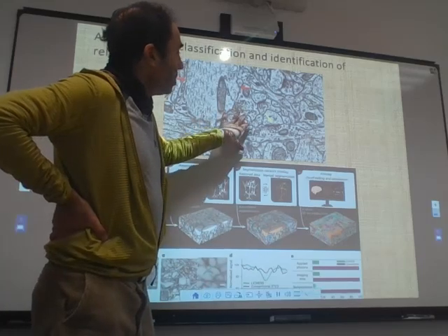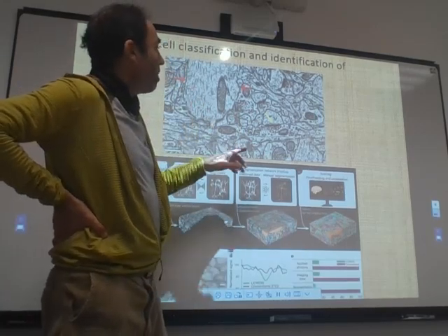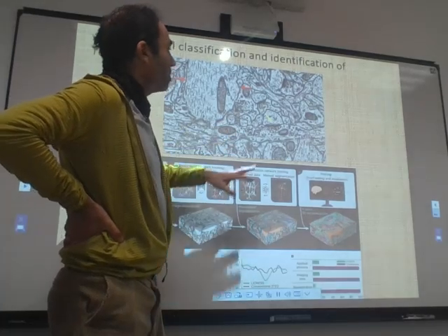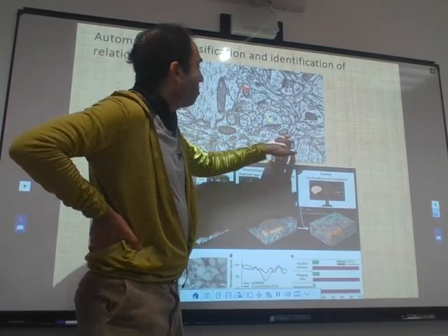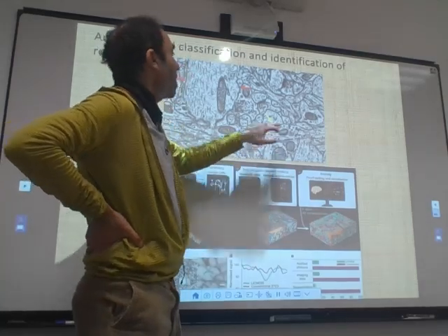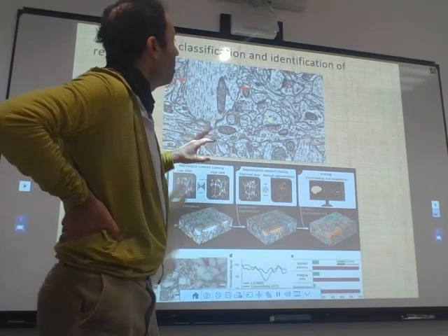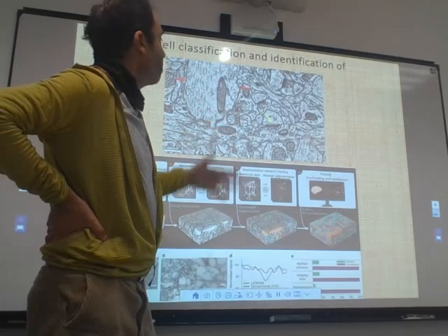Okay, so this is anatomical connectivity. I think it's clear what we're talking about: when there is a connection, you want to recognize it, you want to quantify it, you want to look at the statistics, the number of mitochondria around, the number of vesicles participating, the size here. You can look at if there are microglia cells around. You have to do all this labeling to do this.